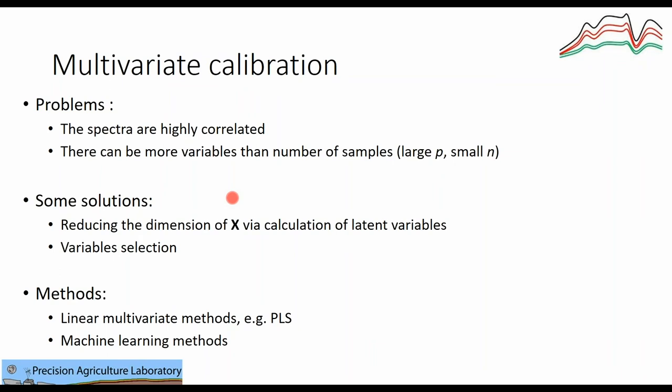Anyway, so how do we predict a particular property out of the spectra using multivariate calibration, with this black box, well, black box for most of the people? It's basically a dimensional reduction, which is a PCA, a PLS, partial least square regression, to the target variable.